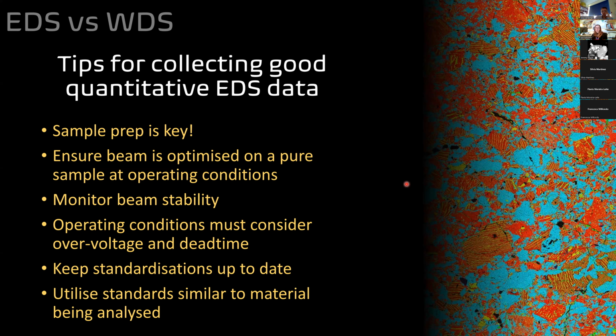You keep your standards up to date. As your instrument gets older, the beam decays, or as things change in the surroundings around it, and you make sure your standards are up to date. I try and do them every 6 months here. It takes about 3 days of my life because we have a lot of instruments and about 4 different standards blocks I need to get through.